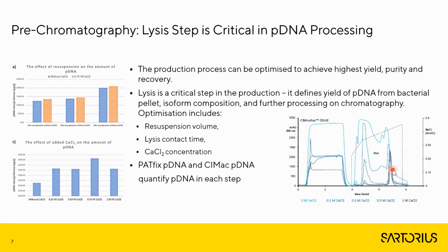Here I'm not, in this case, optimizing for anything. I'm giving an example of things that you can see relatively early on in the process. Very few other techniques are able to give you information about the concentration of plasmid so early on in the process and do so accurately. So mass balance calculations throughout the process are much, much more accurate.